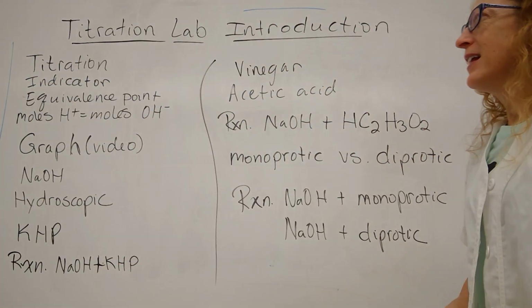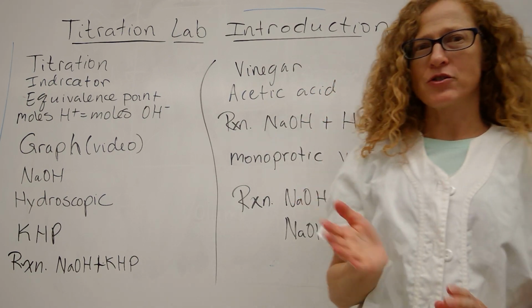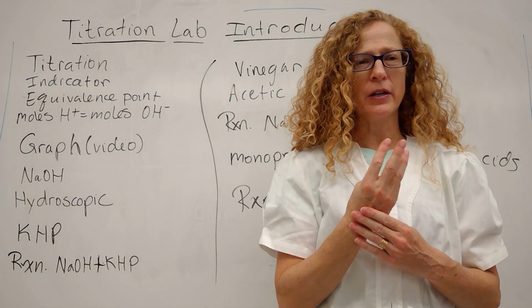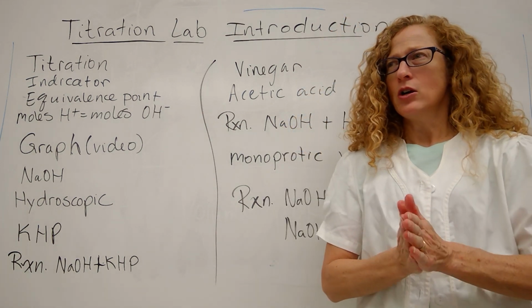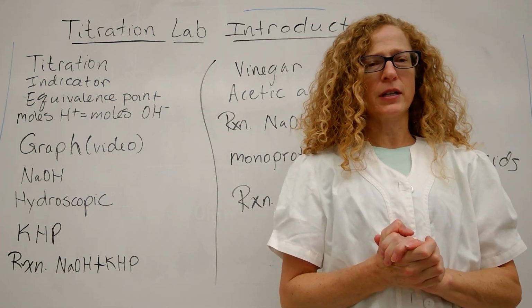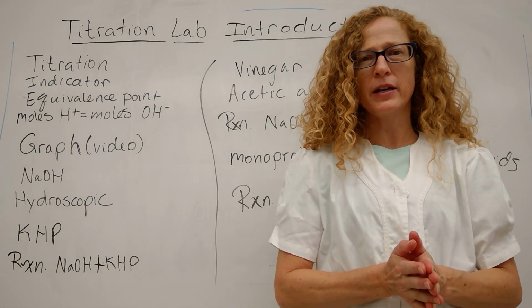Deb here. So we're going to do a titration lab, and the titration lab actually has 3 parts. Usually we do this in 2 lab periods, but instead we're going to try and do this in the lecture and lab periods. We're going to do the whole lab in one evening.